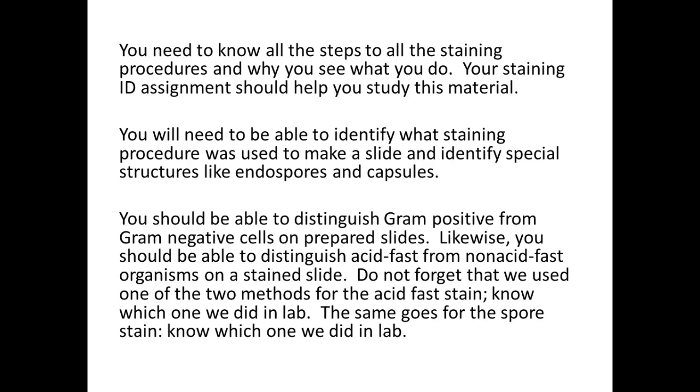Don't forget, we used different methods. We're using the ZN method for acid-fast and Schaefer-Fulton for endospore. It's very important to know what method you're using, because that also is why you see the colors that you see, especially for the endospore stain. There's a couple of different methods out there, and they use different stains in different procedures, and therefore you get different colors. It might throw some people off.